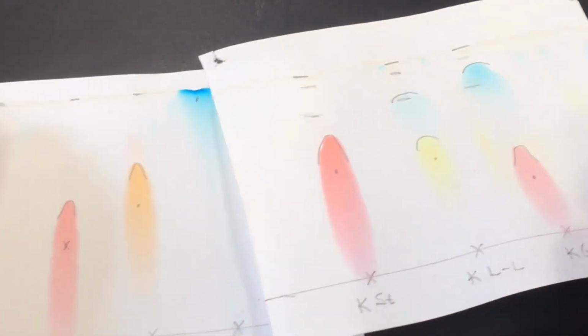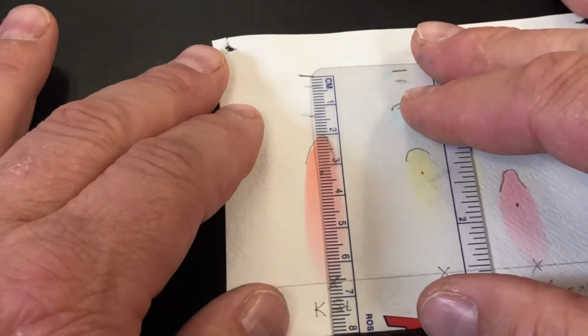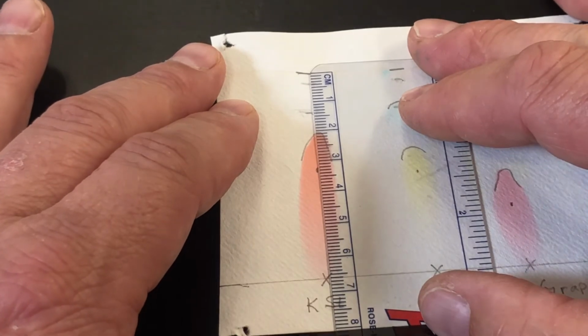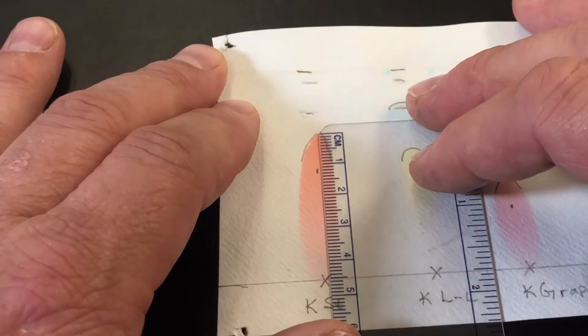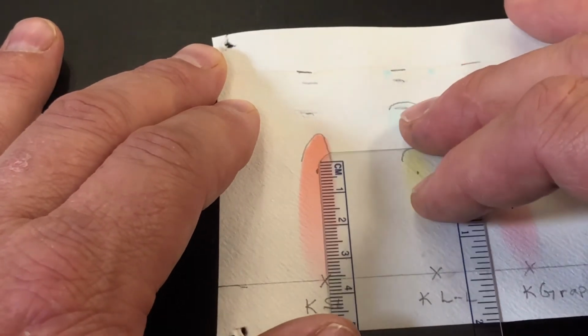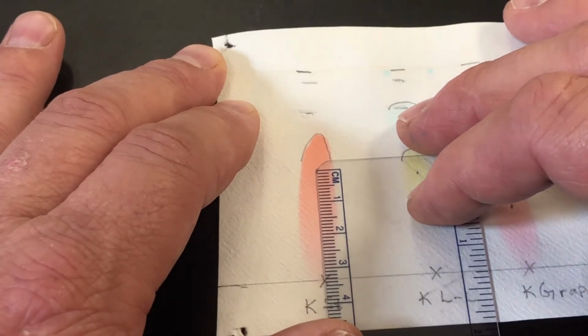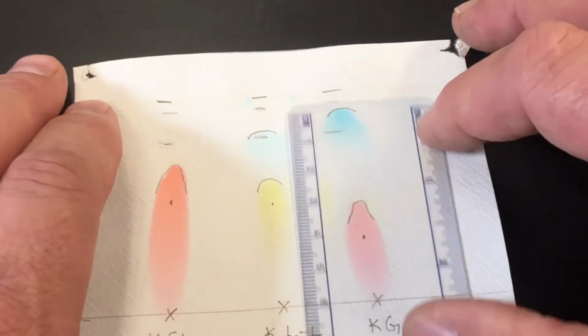All right, here we go. So for our strawberry, I made a couple of different places and I kept marking it as it wasn't completely dry. And so that's why you see several marks here. So for the strawberry, the solvent traveled 6.60. The very tip of the red traveled 4.50, and the center mass is 3.30.